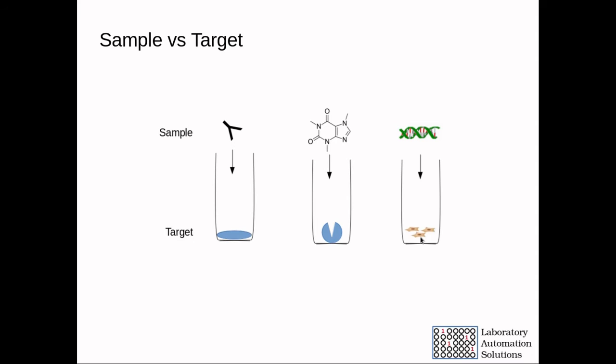Although targets are not the focus of LIMS Nucleus, target information can be critical to the proper evaluation of an assay. Consider an analysis where an antibody is being screened against antigens that represent the human, murine, and monkey homologs of an antigen. LIMS Nucleus will catalog and export target information for merging with the auxiliary software.